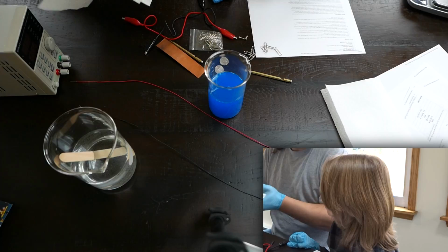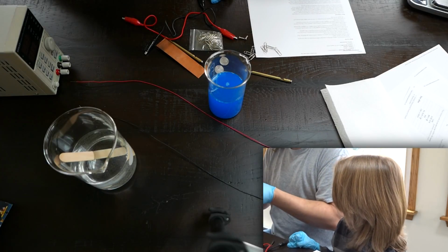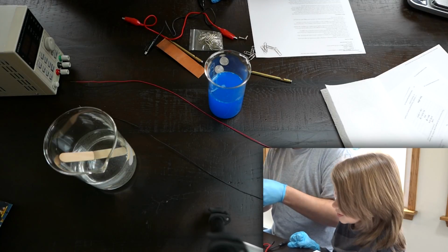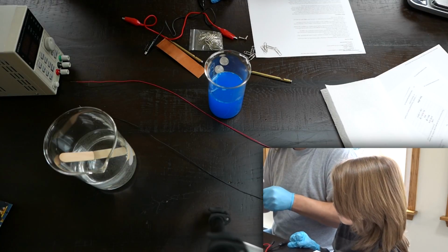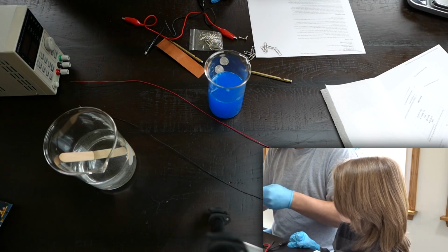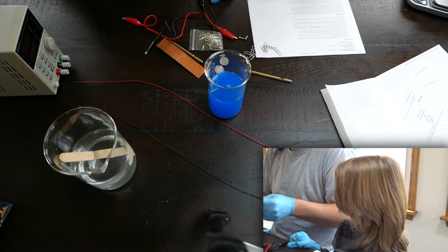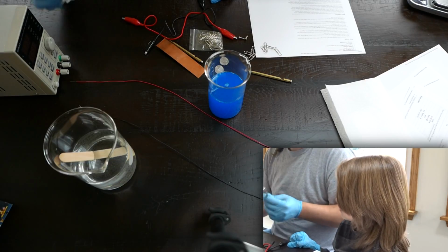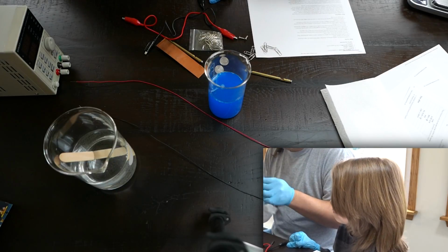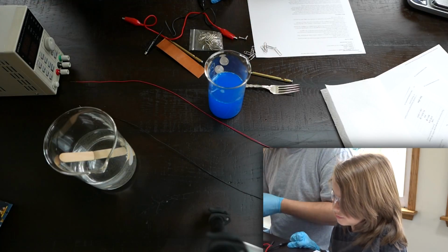We're gonna make them better. We're gonna make them copper covered, right? Yeah. I don't think anybody's gonna agree with that, though. Pretty much, I think silver's better than copper. It is, but we're only coating it. All right, and we're just gonna lean this against. If you were to sell this fork, would it still sell at the same price? Well, the weight of the silver that's used in the fork would probably be the same value. So those are cleaned off.